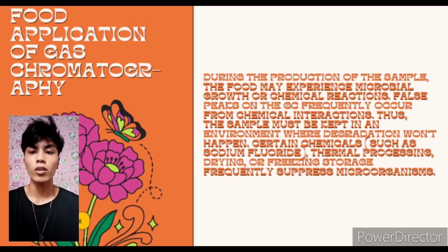Ang food ay nagkakaroon ng pagtaas ng microbial o nagkakaroon ng chemical reaction. Para hindi po ito magka-degradation o mangyari on the process ng GC, mapapanatili natin ito sa pamamagitan ng hindi natin aalisin sa isang environment para po hindi ma-stop ang pagpoproseso.